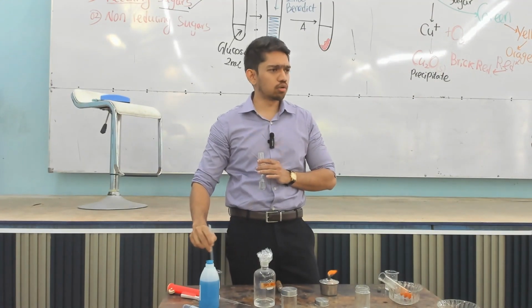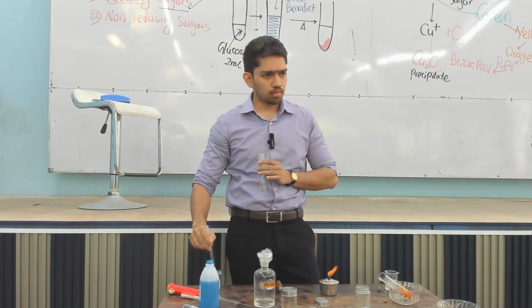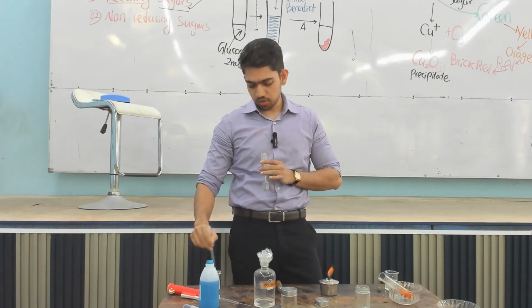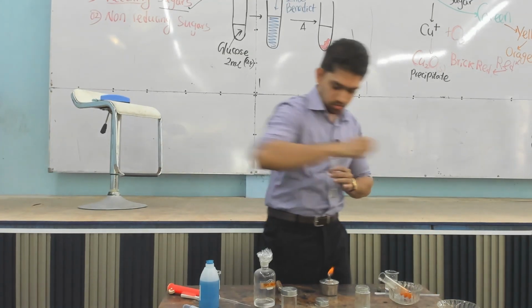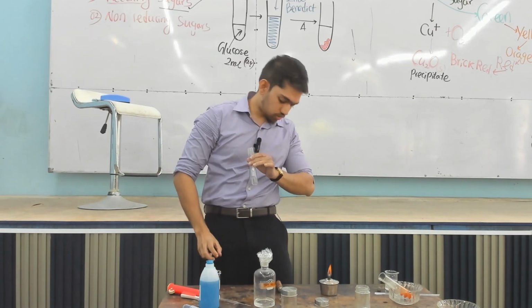And we have some coconut oil to do the identification of lipids, and some egg white to do the identification of proteins, right? Those are the standard tests. We will try them, okay? It's already 5.